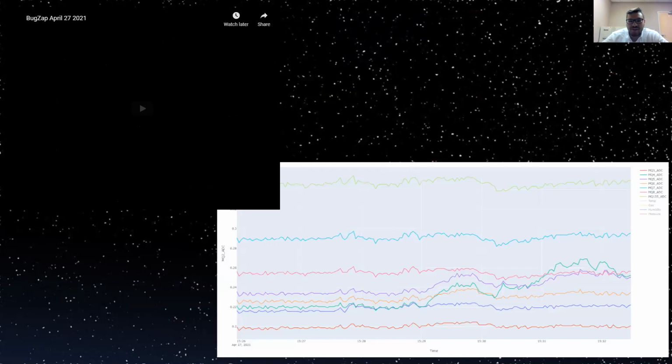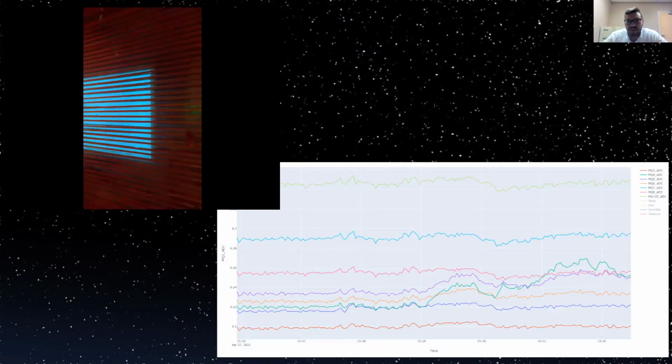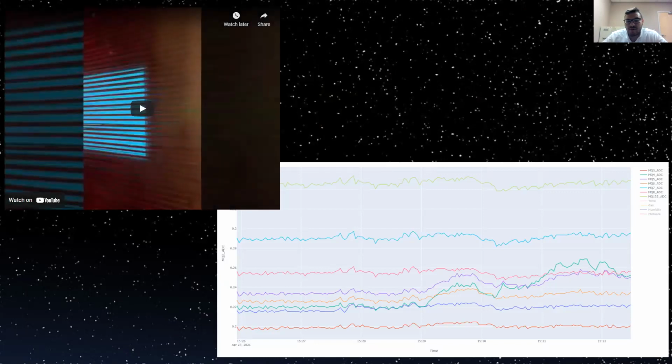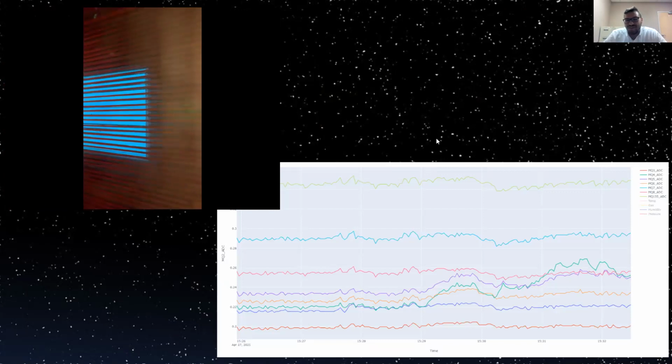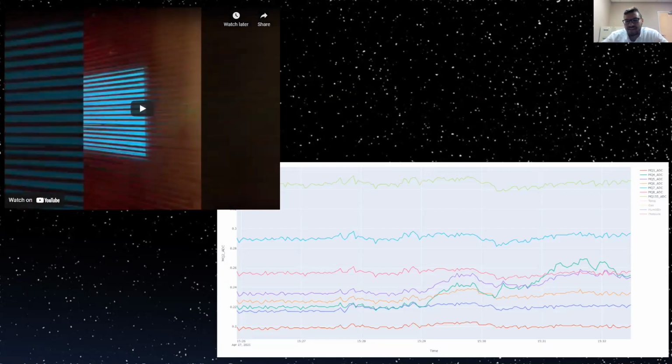And this next one right here, you can see on the image on the left, and I hope everyone can see it clearly, one of the moths being actively fried, if you will. And on the bottom right is our same gas cell responding to the emissions of that moth as it gets fried.